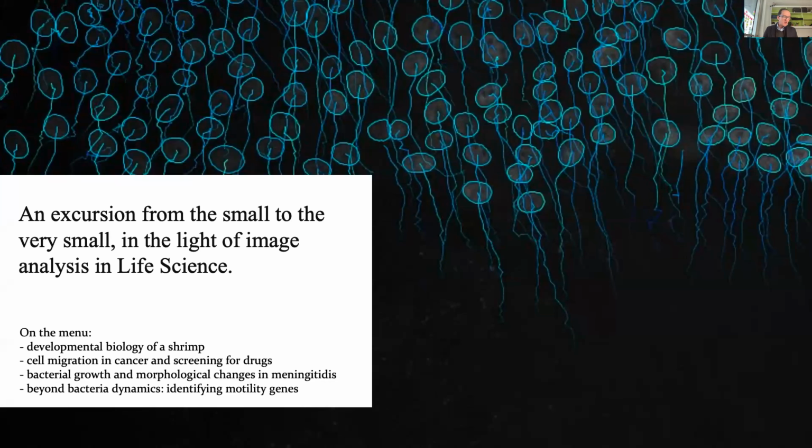So, in the second part of this talk, I think I still have like 15 minutes. I would like just to entertain you with examples of image analysis that we've been doing in the core facility, just to illustrate what the impact of imaging on science would be. Most of what I will show is either focused on tools or very preliminary. Hence, there will not be big conclusions on science. I will mainly present the techniques.